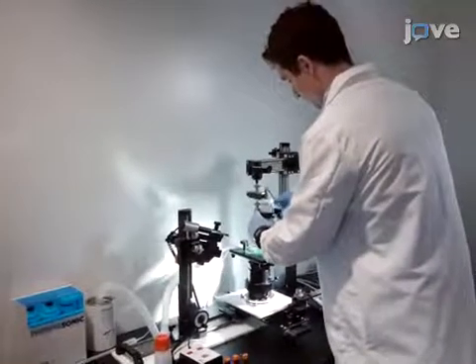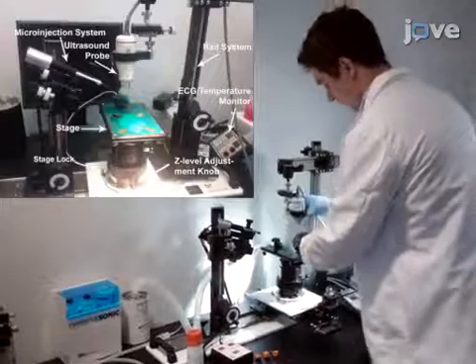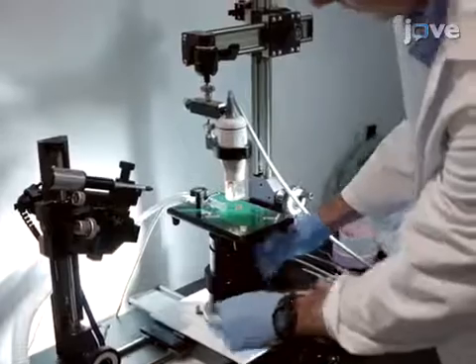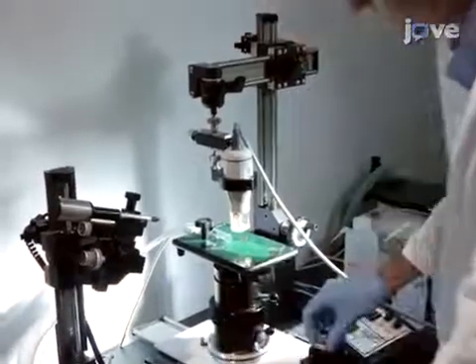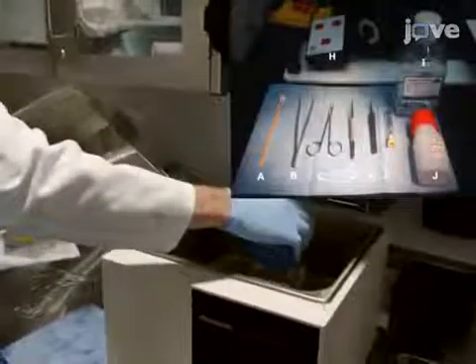Begin with setting up the stage, mount, and probe. Next, set up the instruments and begin warming up a stock of pH 7.4 PBS to 37 degrees Celsius in a water bath.